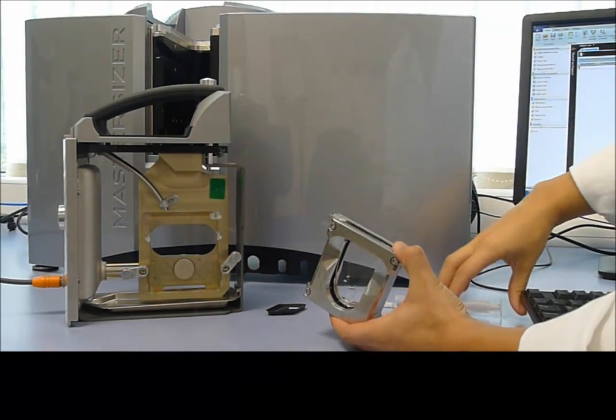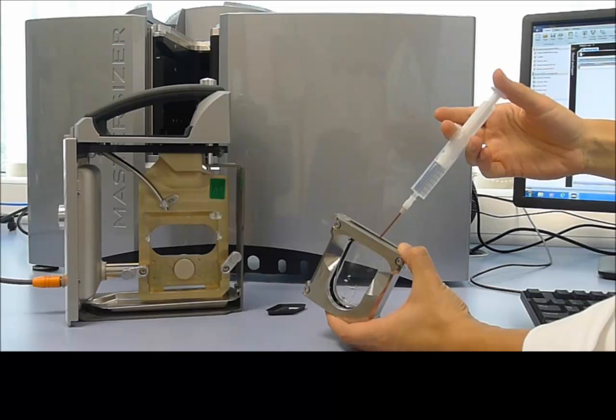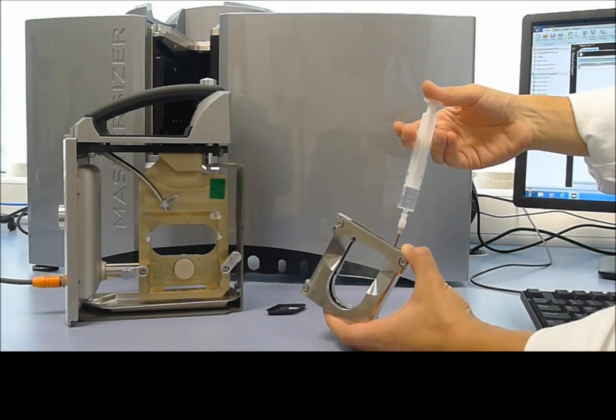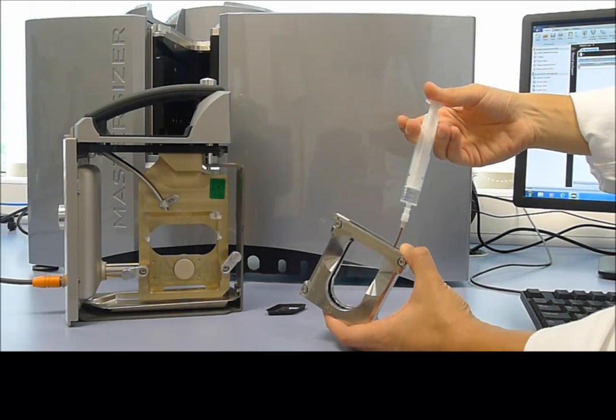The first thing we are going to do is to fill the cuvette with dispersant. In this case we are using water, and we can fill the cuvette to between 6 and 7 mils. We are using a syringe to fill it gradually so that we don't introduce any bubbles.